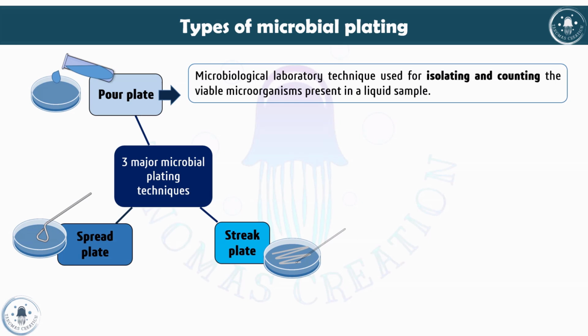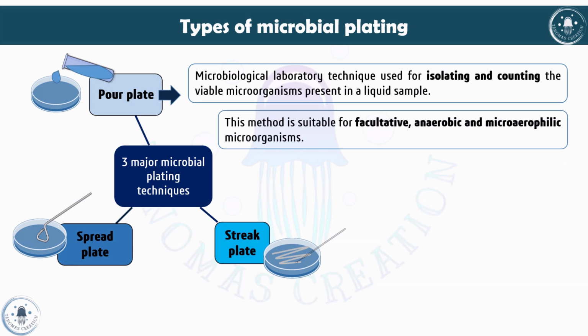Here the liquid sample is very important. Without the liquid sample, the pour plate method cannot be executed. In order to use the pour plate technique, you need to have your sample in liquid or in suspension. This method is very suitable for facultative anaerobic and microaerophilic microorganisms.